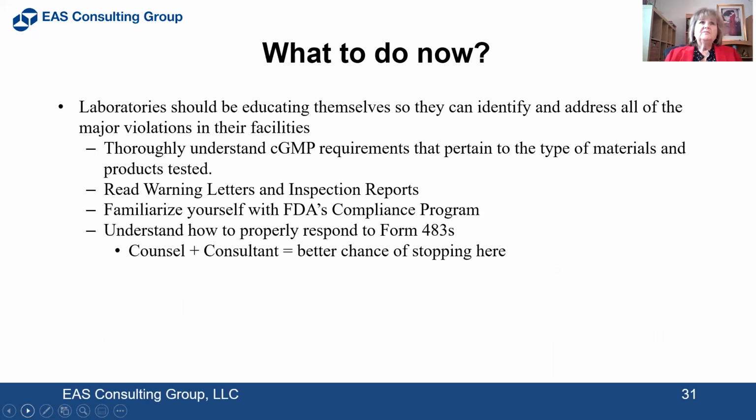So laboratories should be educating themselves so that they can identify and address all of the major violations in their facilities. You need to thoroughly understand the cGMP requirements that pertain to the type of materials and products that they test. You need to read those warning letters and inspection reports. I would really suggest you sign up for the FDA warning letters. Very useful.